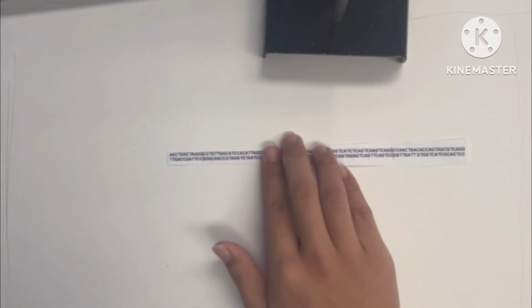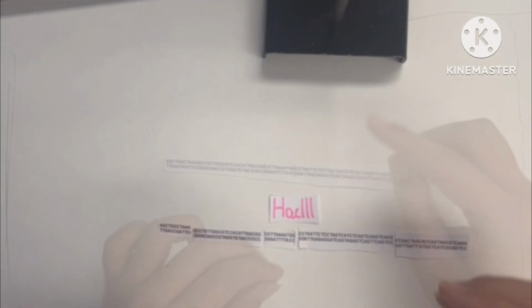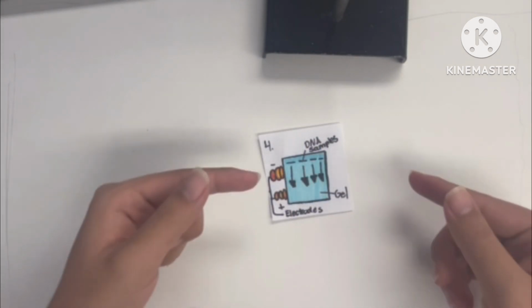Now to demonstrate, this is a strand of DNA. The restriction enzyme used is called HaeIII. As you can see, the DNA is cut at specific points based on the sequences. Snip. Now the fourth and final step is obviously gel electrophoresis.